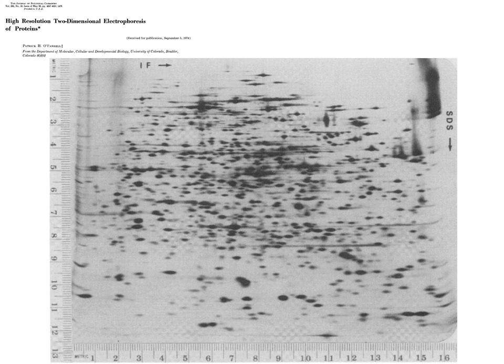The result is a gel such as this one of an E. coli proteome, the image taken from the original O'Farrell paper. Each one of these spots represents a protein isoform with a specific isoelectric point and a specific molecular mass. It should be noted that proteins of different sequences can have amino acid compositions that result in the same isoelectric point and mass, and thus these proteins would migrate to the same spot on the gel. It can happen, but the likelihood is low.